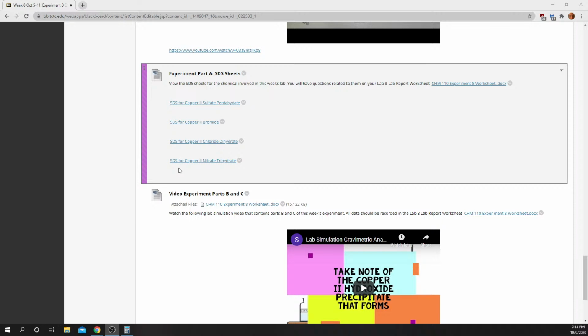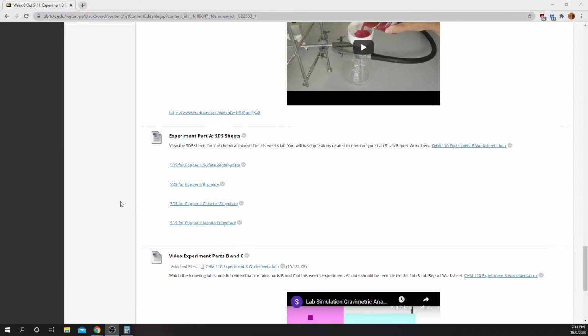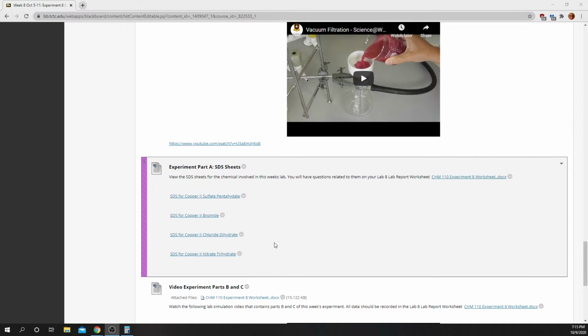So this is a combination of percent yield and stoichiometry. You do the stoichiometry for each of these salts, and then you do the percent yield, and that would tell you what mass of products you would expect for each of those 4 salts. And thus, you compare that to the mass of products you actually got, and you would know which of the 4 salts it is.